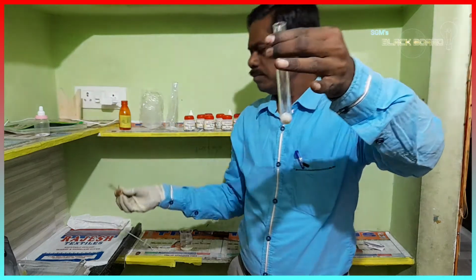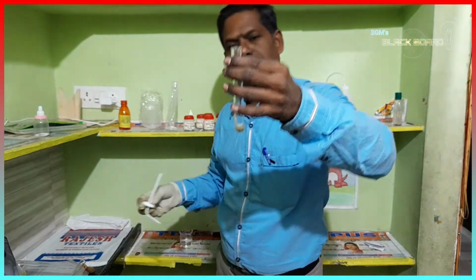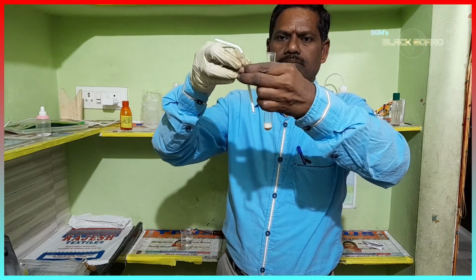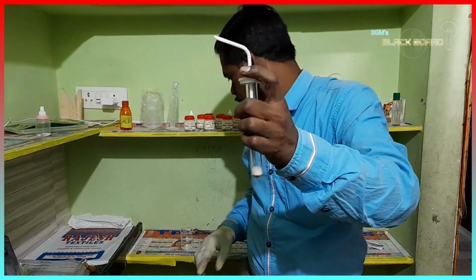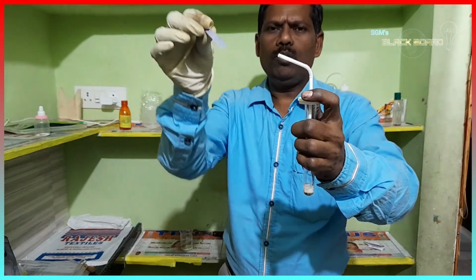Slowly we need to add. So now a gas is producing here. You can see a gas is producing. So I will close it with the lid. See, from here the gas is producing. Let us test it now with a blue litmus paper.